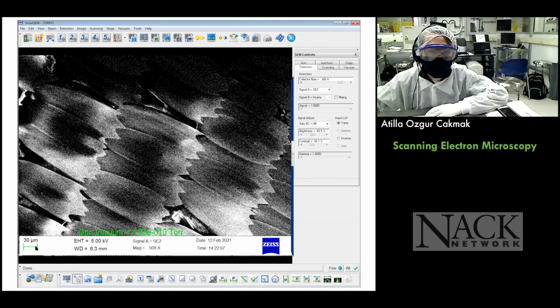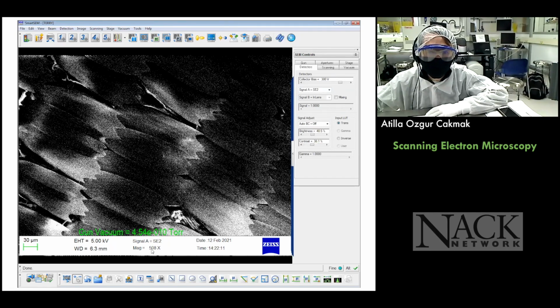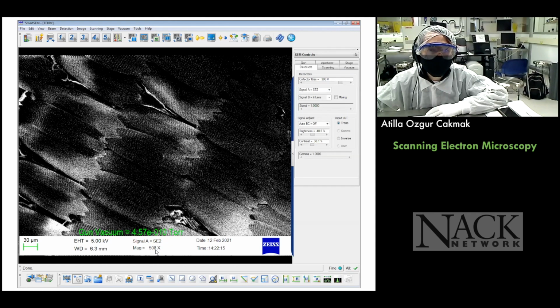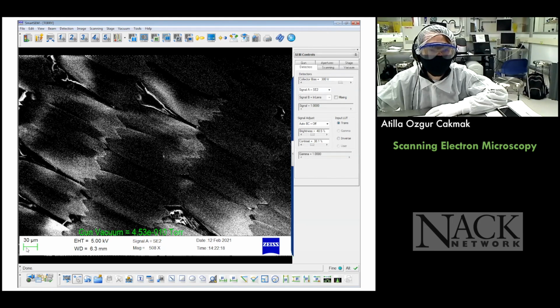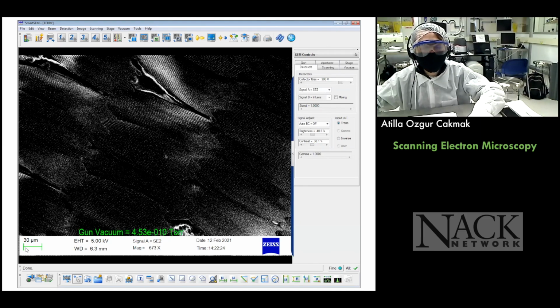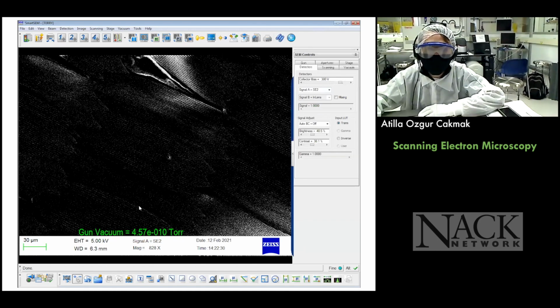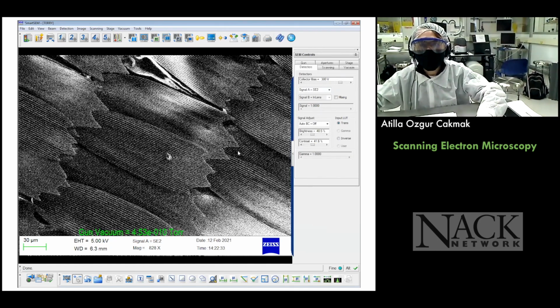How can you see where the magnification is? Well, this shows you the magnification number, magnification 508. This is still within the constraints of the optical magnification. And look at the scale bar. It's going to get larger as we move along, just like you read from a map, right? So that means the objects are going to get smaller and smaller. We need to increase the contrast a bit here too. So we're going in.